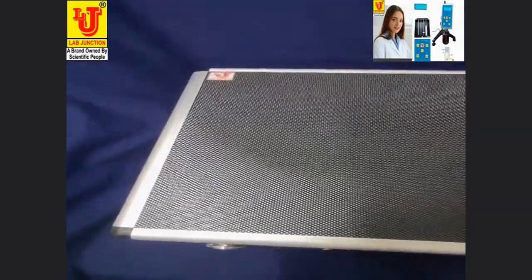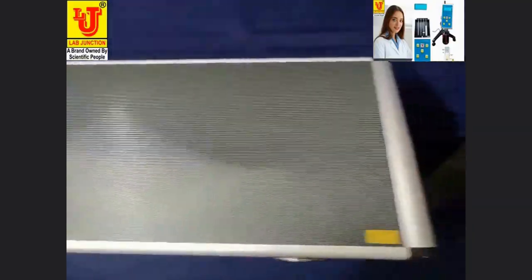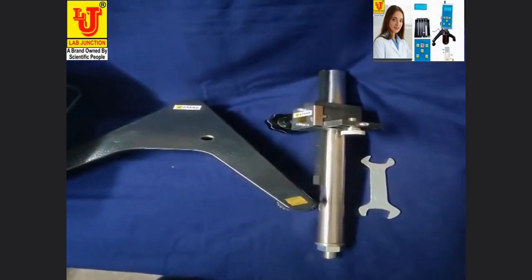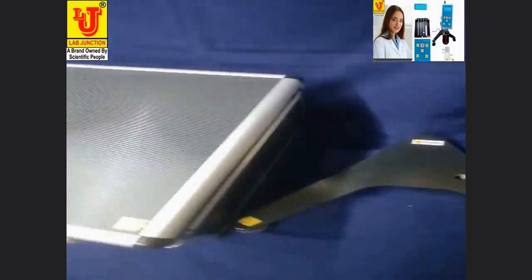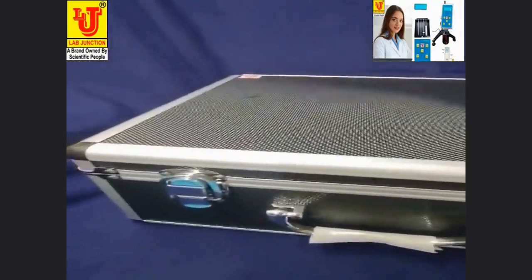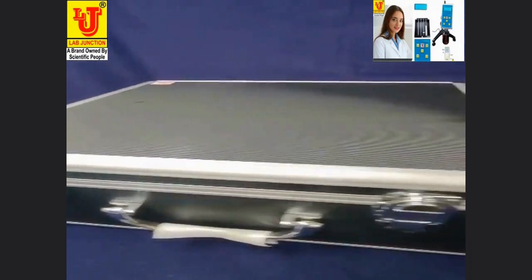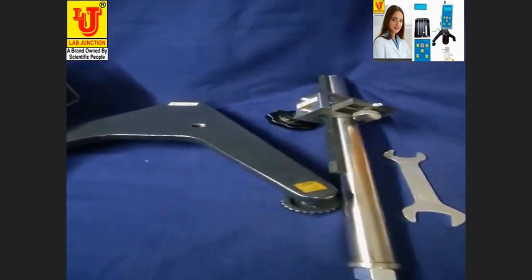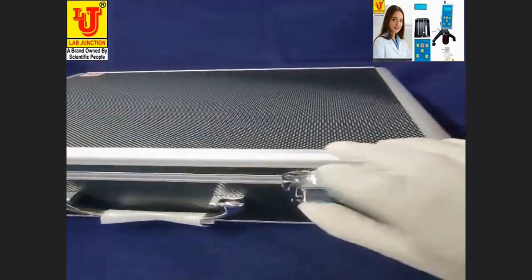Lab Junction Digital Viscosity Meter, Model LJ3421. I am unboxing this.